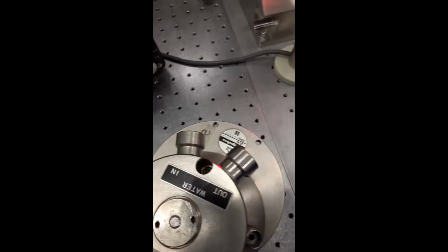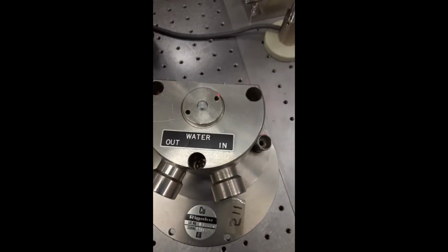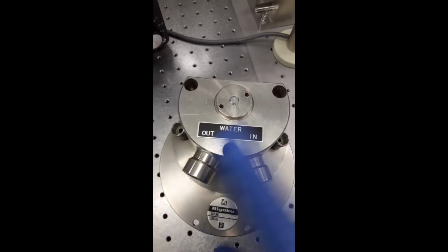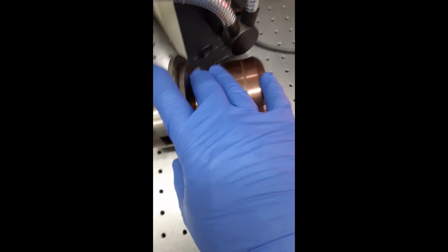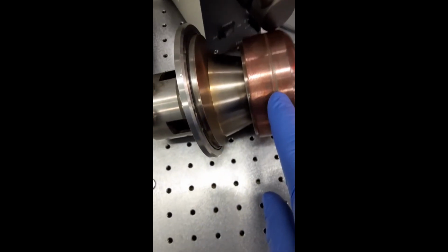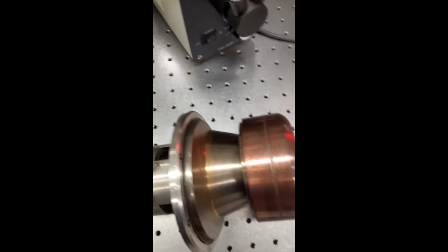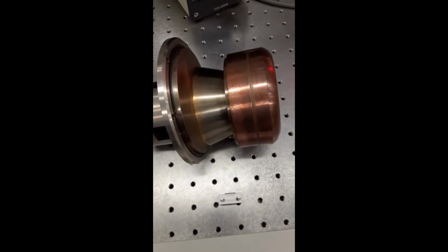So while it's running, there'll be chilled water pumped through the anode, and there's actually tubing that comes out, and the anode itself is filled with water. That's how the X-rays are generated within the tube tower.